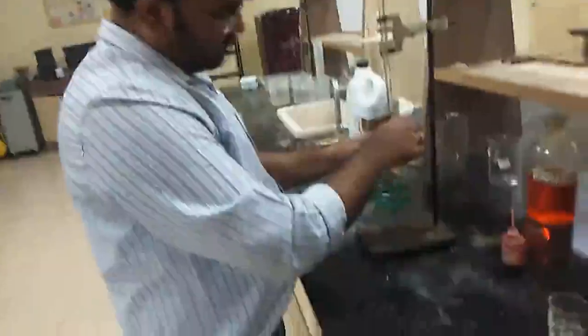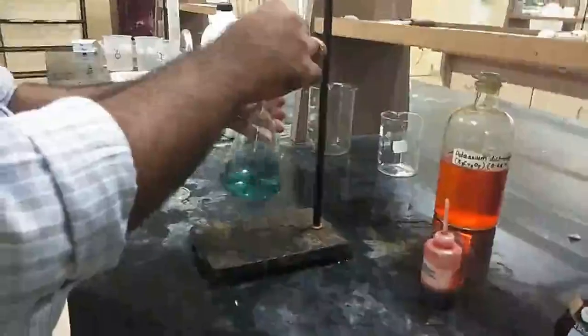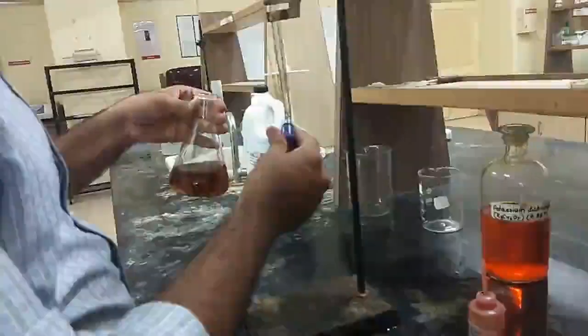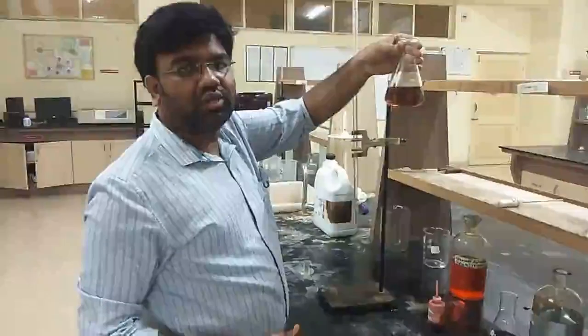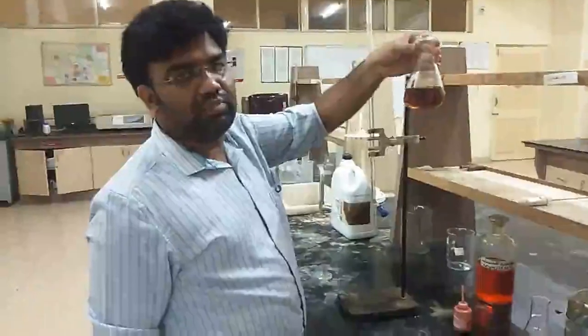Right, so observe the color change now, right? So yes, a stable brown color is obtained, and the reading that we have got is 14.6 for this sample, right? So next we are going to do the calculation and find out the COD value for this sample.